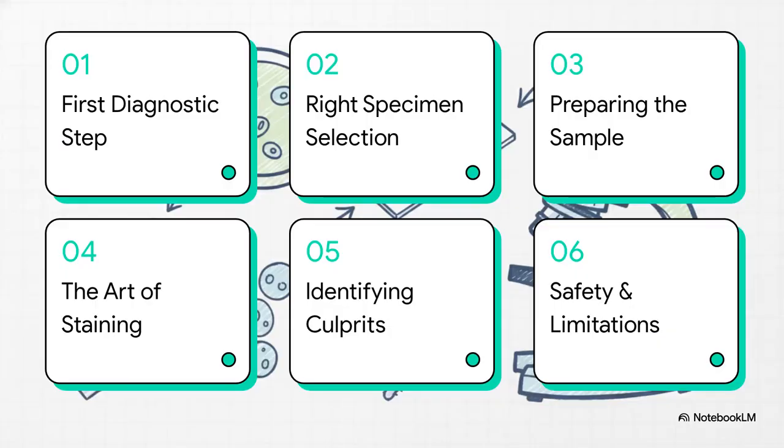So, here is our roadmap for today's investigation. First, the first diagnostic step. Number 2, selecting the right specimen. 3, preparing the sample. 4, the art of staining. 5, identifying the culprits. And finally, number 6, safety and limitations.